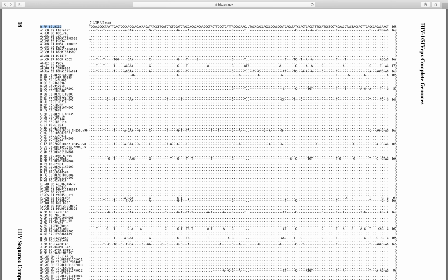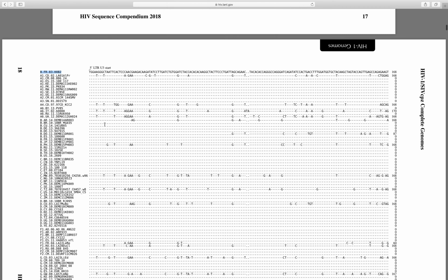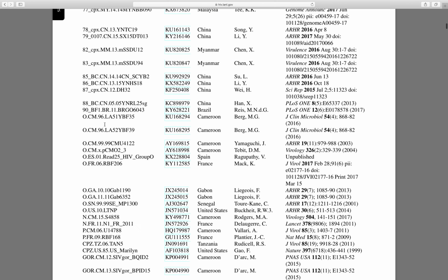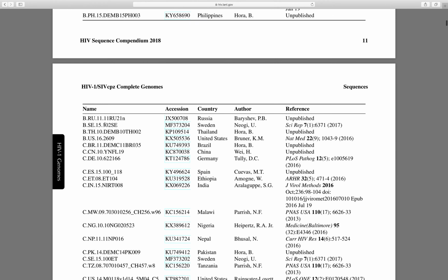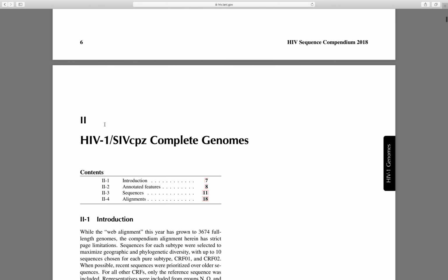There are a couple of different things that I have to go back and look at. But you have dots and you have dashes, so we can actually look to see what those mean. Over this table, they should be able to tell you that.